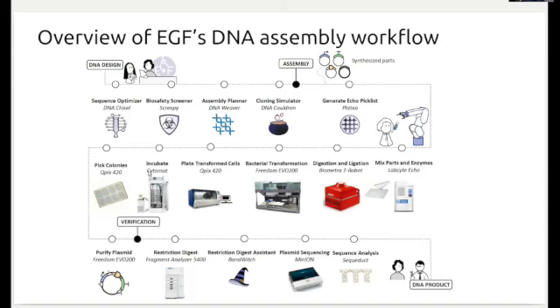Once you have these colonies, we purify them using, again, the Tecan Freedom Evo machine, and we go on to the verification stage, which is currently fragment analysis.